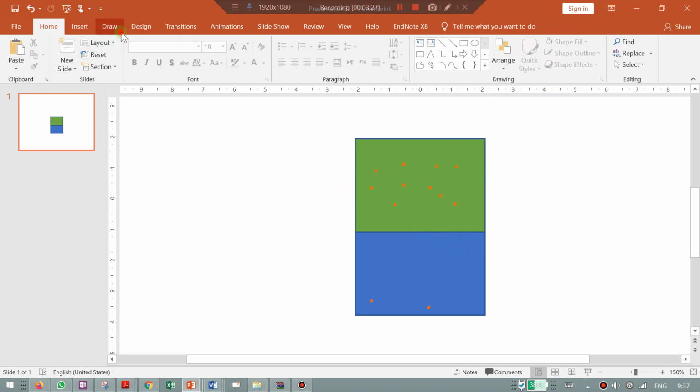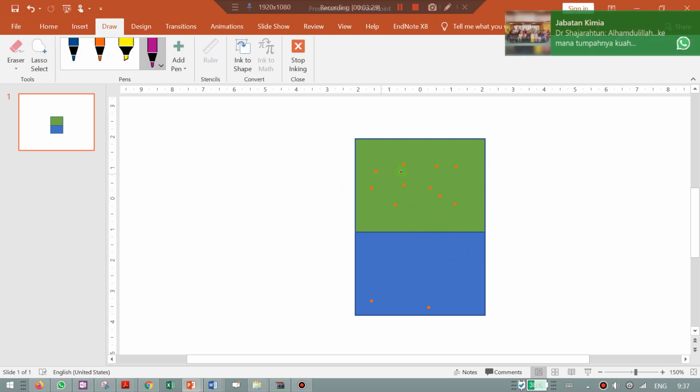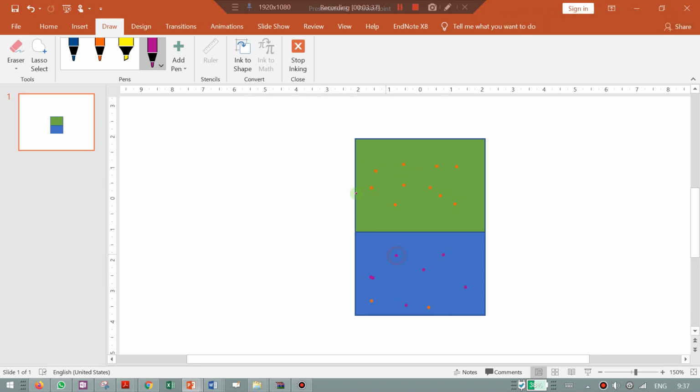Because we want to extract our analyte only without extracting the impurities. Let's imagine the purple one is our impurities. We want to extract our analyte of interest only, because impurities will disturb the reading and also somehow contaminate our instrumentation. So we want to extract our sample only.